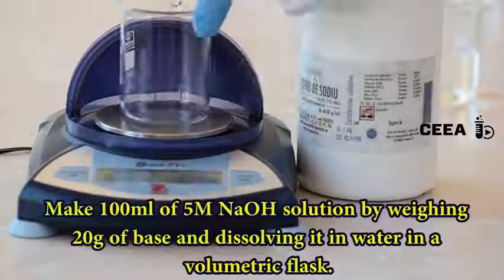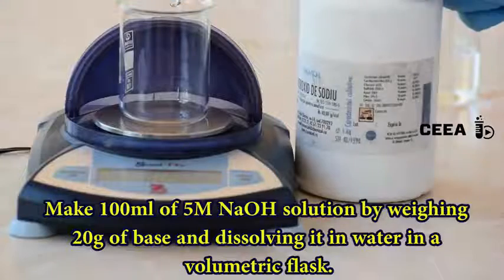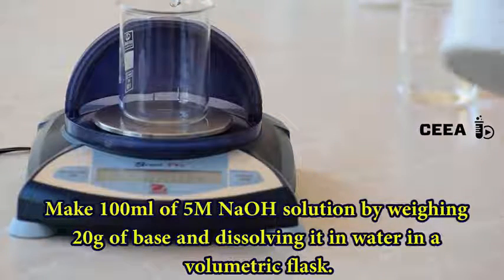The third step is to measure 20 grams of sodium hydroxide in order to make 100 milliliters of 5 molar solution.